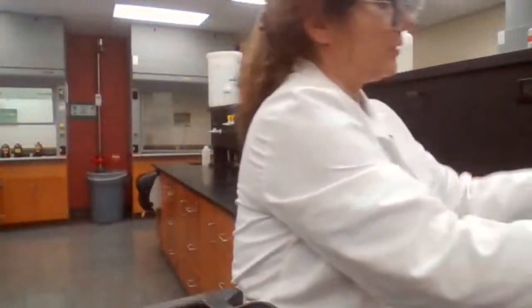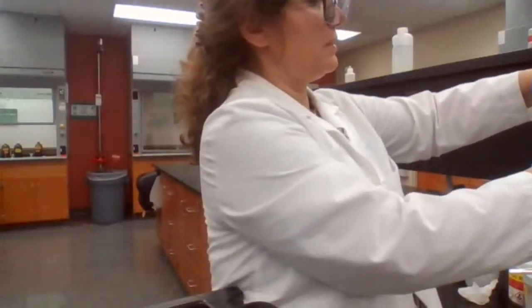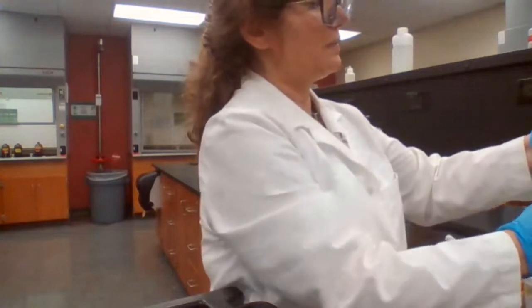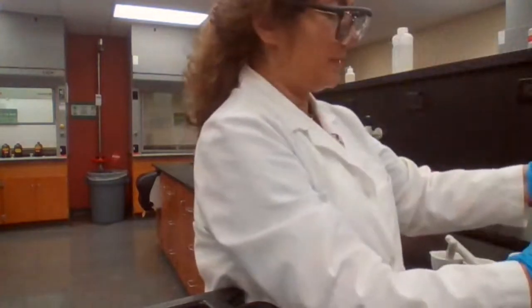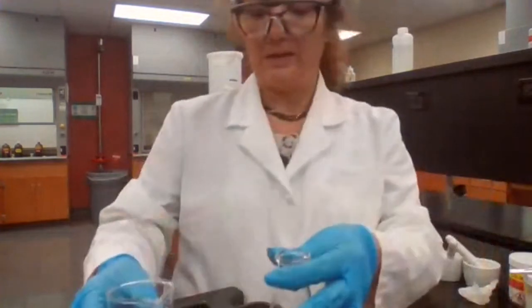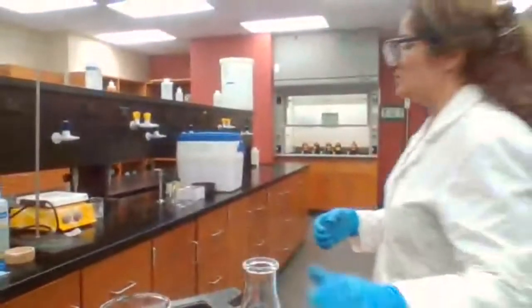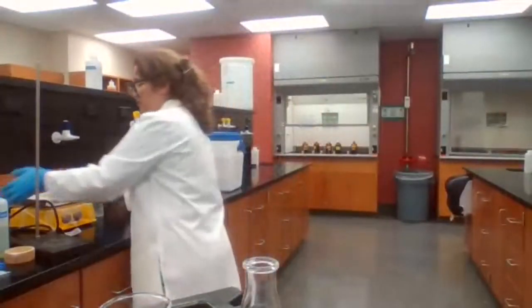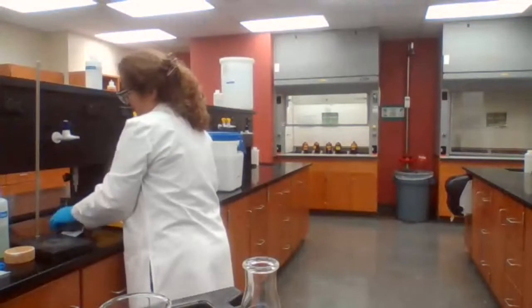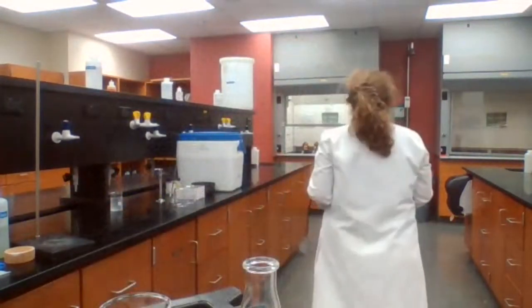Now, we are going to transfer the liquid portion into the beaker. I'm going to set up the hot plate first and then transfer, just to make sure that most of the moisture is absorbed. You should give about 2 to 5 minutes for the anhydrous agent to work. So I'm going to set up in the hood.